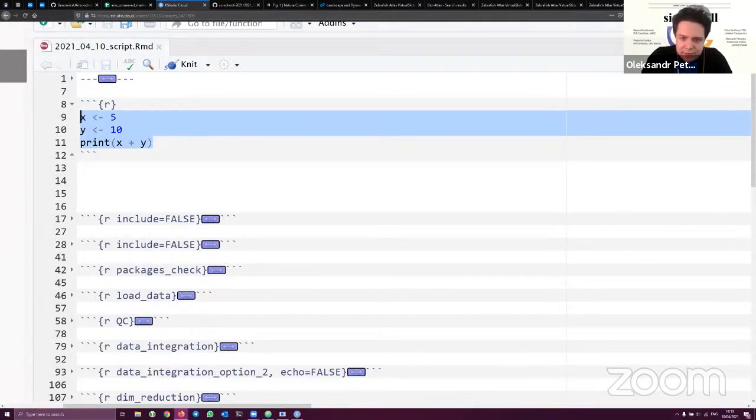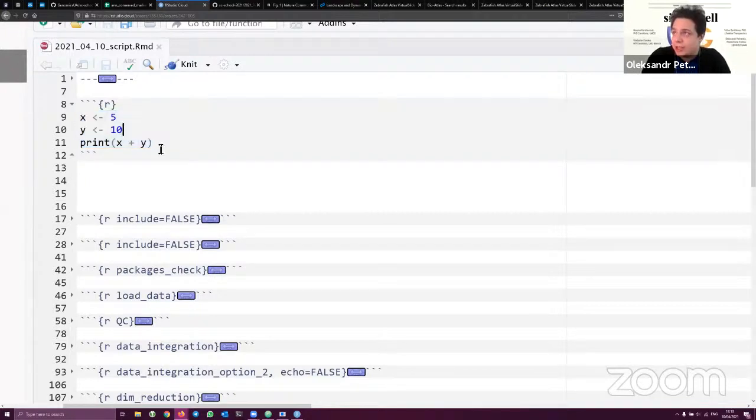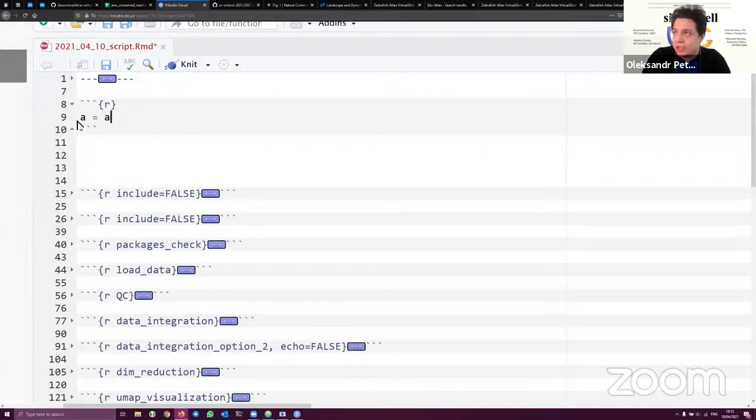We don't use something equals something like that, because in R it has a different meaning. We will sometimes use it inside the functions, but still it's not like in Python, for example. It's just a specific of R. That's the best explanation I can give right now.